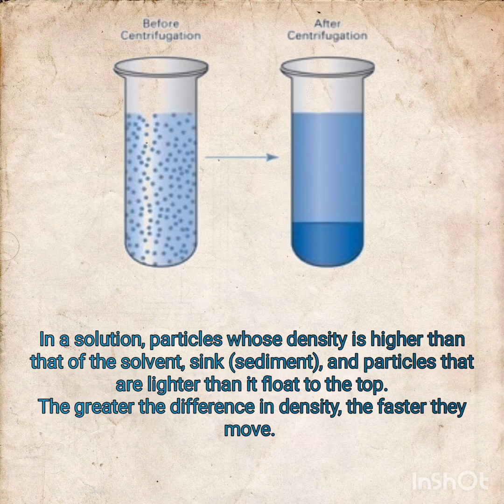Okay, come to the next slide. Here is the diagram. The diagram shows the before-centrifugation phase and the after-centrifugation phase. Look at the second tube after the centrifugation phase. It's so clear as compared to the first tube, which has some suspended particles, suspended debris, and all the other suspended materials which have to be eliminated from the solution or from the liquid.